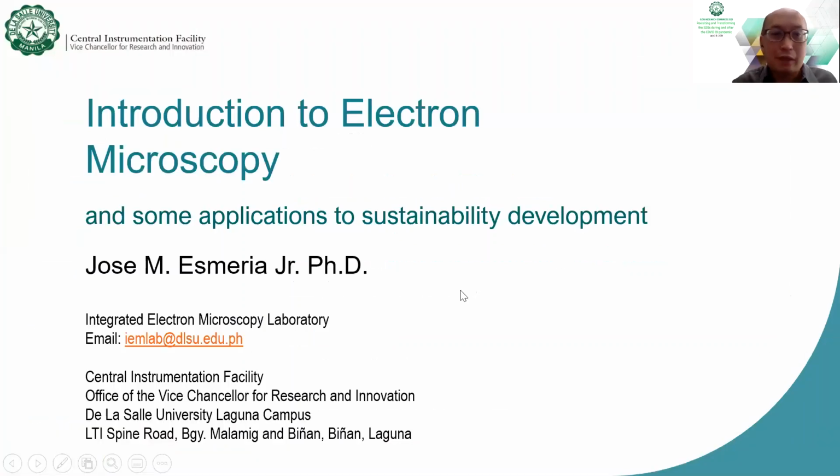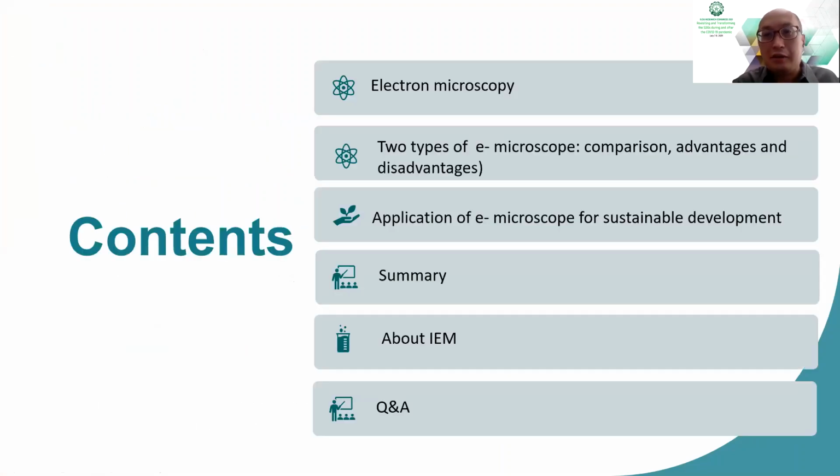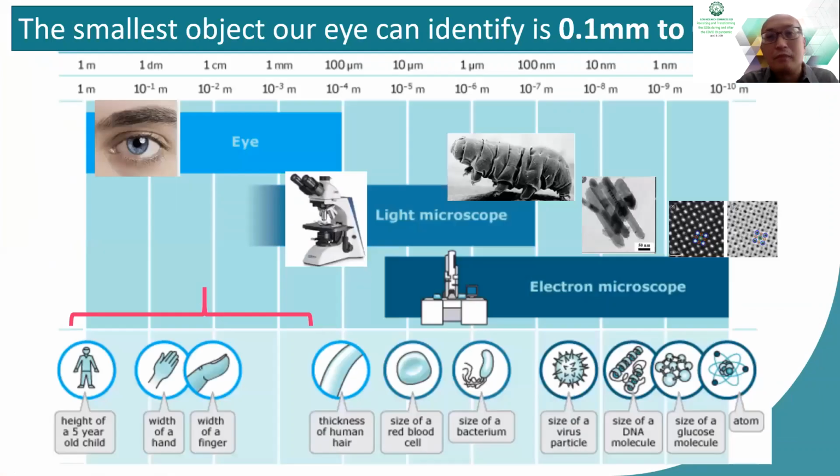Hi, morning. I'm here to talk about electron microscopy, its introduction, and some of its applications in sustainable development. The contents of my talk will be the electron microscope, its two types, its applications in sustainable development, a summary, and a quick tour about IEM.